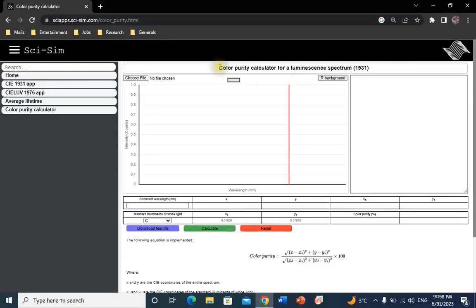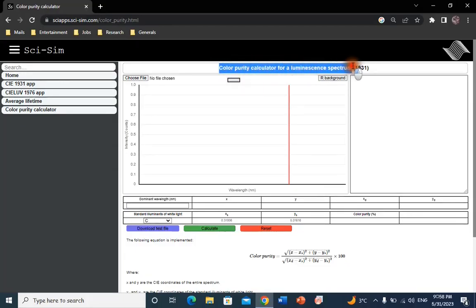Welcome ladies and gentlemen to this quick demo on how to calculate color purity of a luminescence spectrum by using Sci-Sim online app.